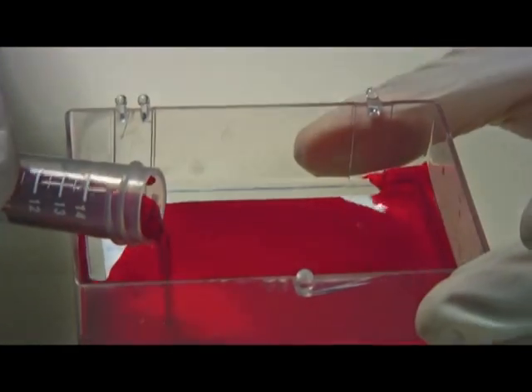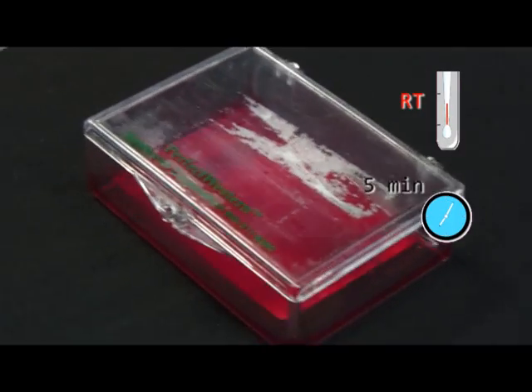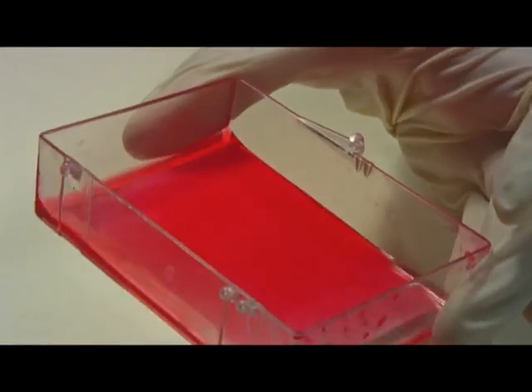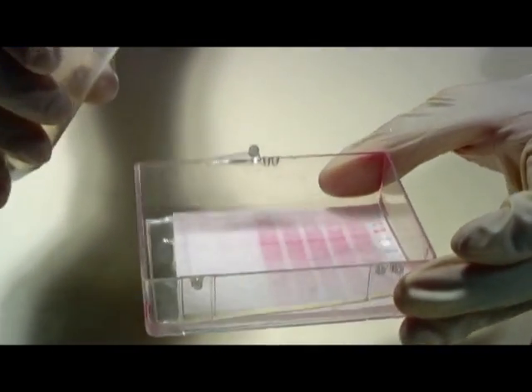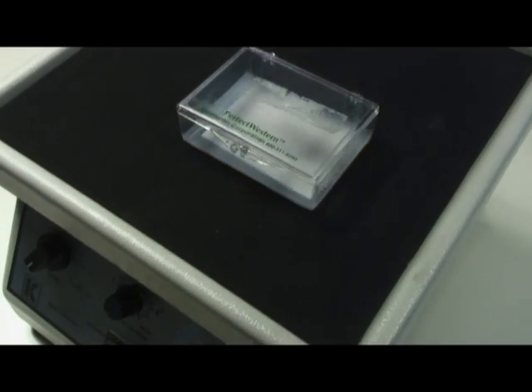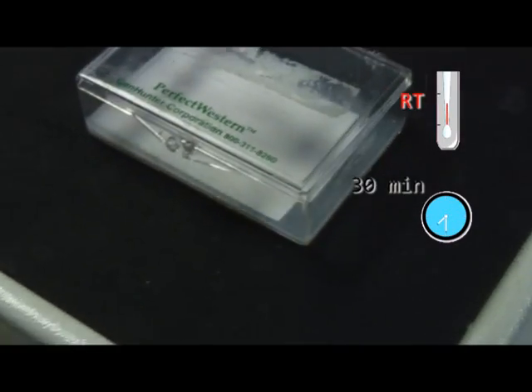Wash the membrane 3 times with distilled water in a container. Incubate the membrane in an orbital shaker with Ponceau Red for 5 minutes. Rinse the membrane several times in distilled water until you can clearly see the transferred protein bands. Finally, wash the membrane with 1 times PBS. Incubate the membrane with 15 ml 1 times PBS, 3% skim milk in an orbital shaker for 30 minutes at room temperature.